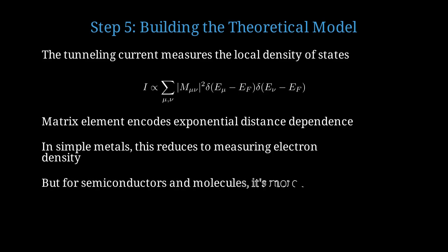However, for semiconductors and molecules, the local density of states has strong spatial variation due to bonding orbitals. The STM can actually image individual molecular orbitals.